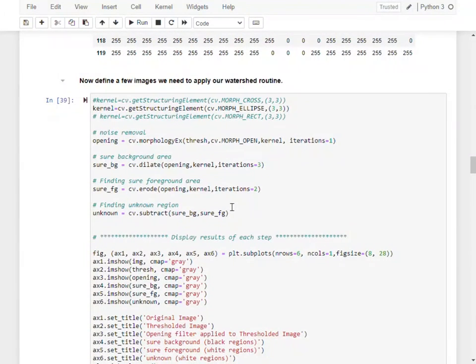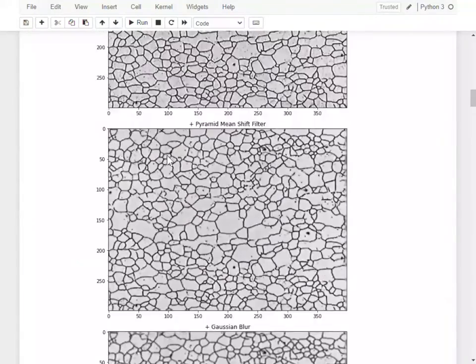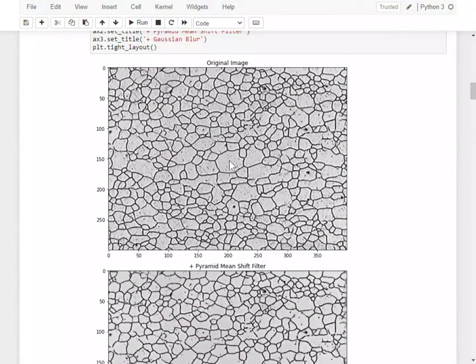So now we've got our thresholded image. And the next thing we want to do is to apply what's called a watershed algorithm. And the idea with a watershed is that we will take the original image, and let's say that I start somewhere here with the original image, and actually it's going to really start in the dark regions, but let's say we start in here.